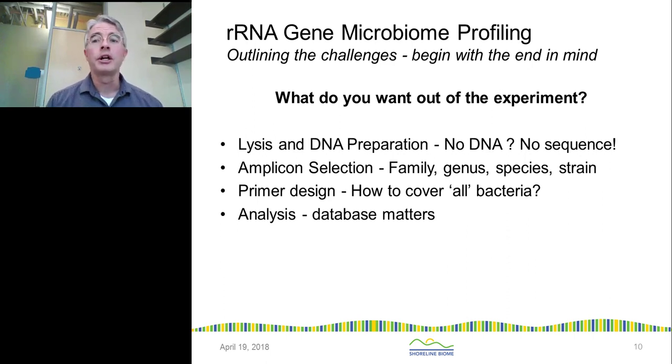So there are a number of challenges when you start a project like this. And really, I think the best thing is to begin with the end in mind. What do you want out of the experiment? What are the tasks that are going to have to get accomplished to get to the result you're looking for? First of all, you've got to get the DNA. Lysis and DNA preparation: it has been known for a long time in this field that the way you crack the cells is crucial to the result.